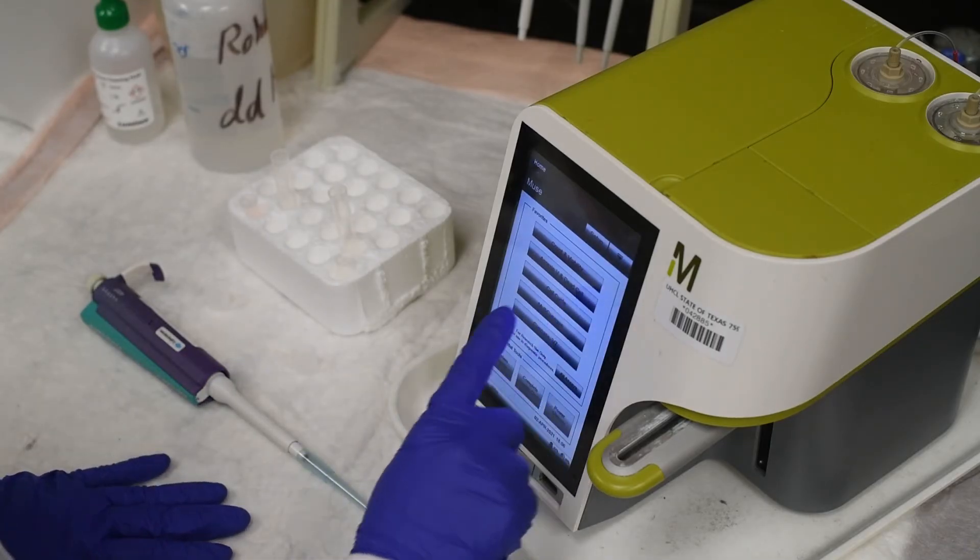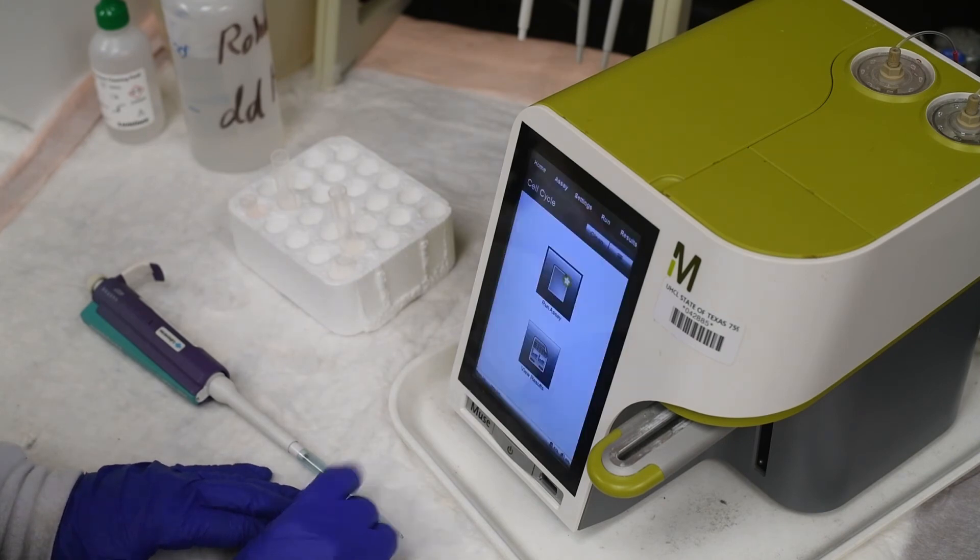After allowing my cells to stain for 30 minutes with the reagent, I transferred them to a microfuge tube.